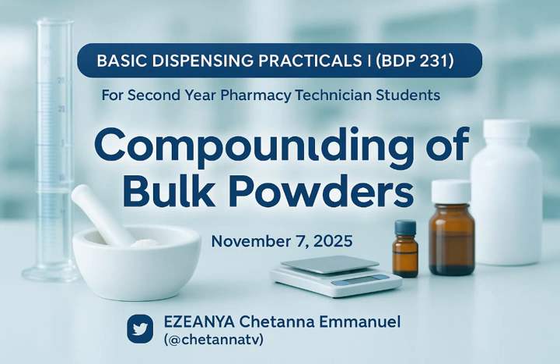Are we together? Okay, so listen up. Now, how do we do this doubling up or geometric dilution? How do we do it? This is how we do it.